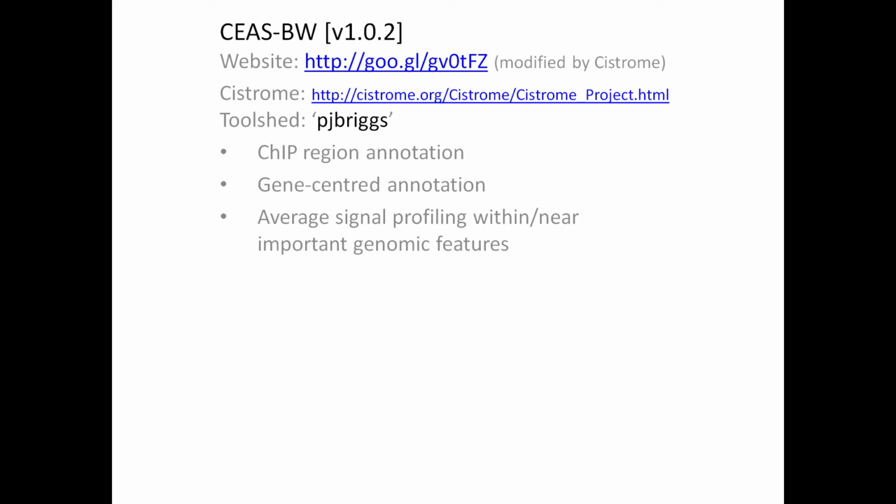I prefer to use the summit region as it represents the epicenter of binding activity for transcription factor ChIP-seq sites. The full length of histone ChIP-seq region should be used, unless it has a very punctate or peaky looking mark.